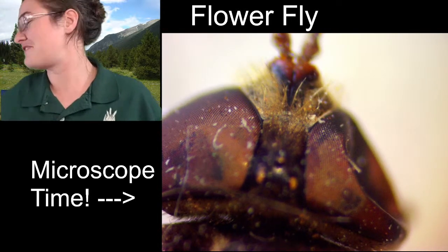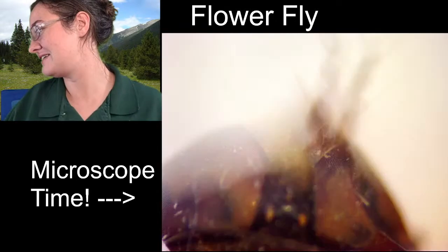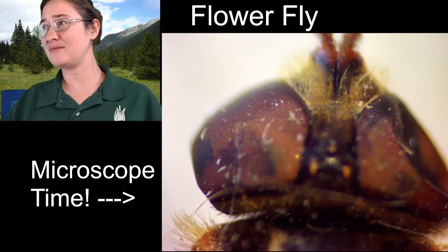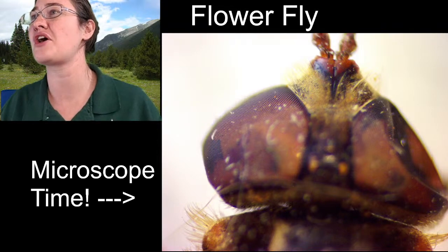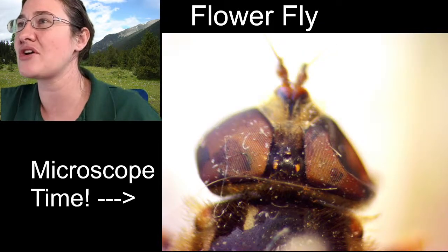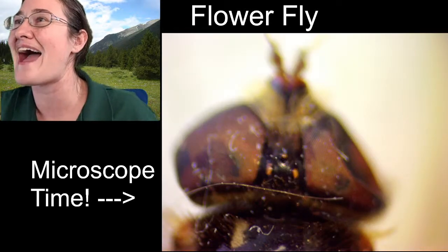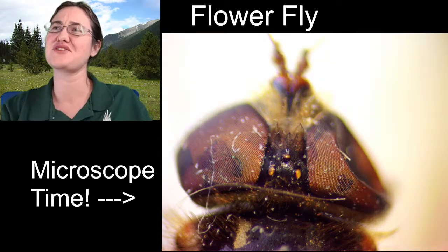Let's look at a fly head. So I want to look at it from above first, and then we're going to look at it from a lateral point of view to really focus in on those antennae, because they're a little bit trickier to focus on, especially when we're looking at the eyes. They're just at different focus levels.